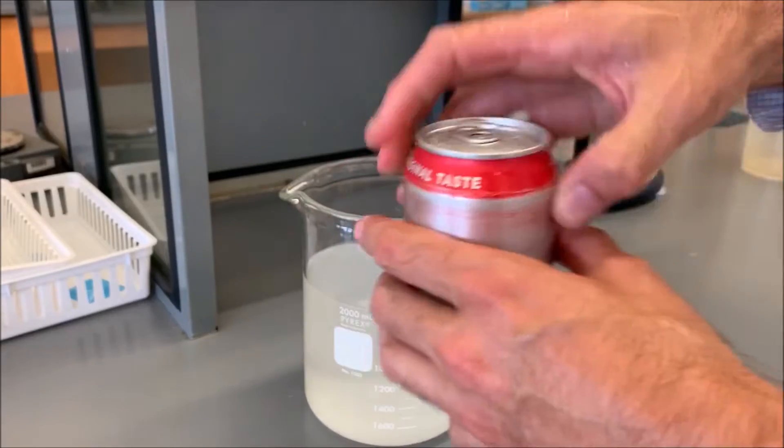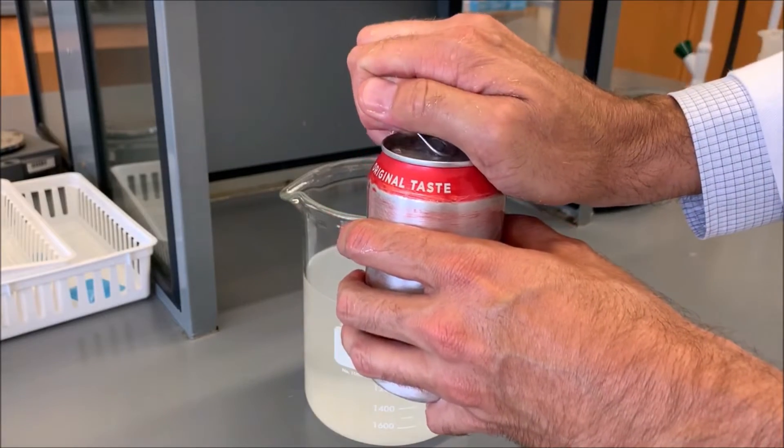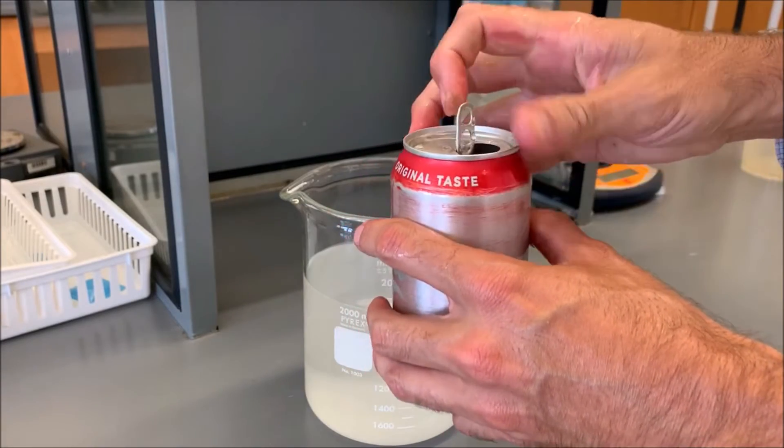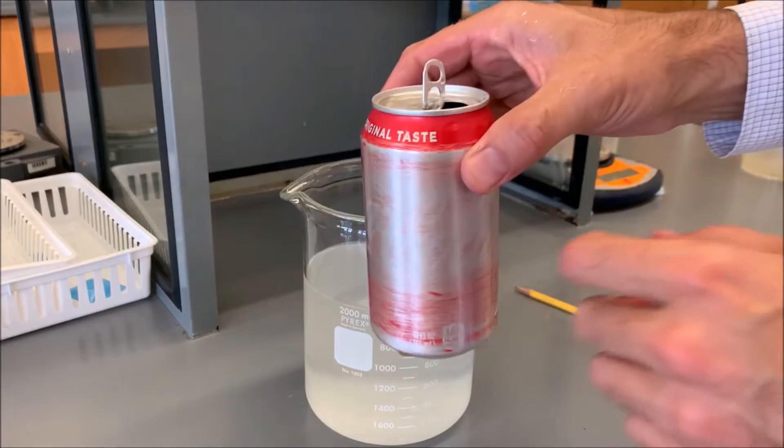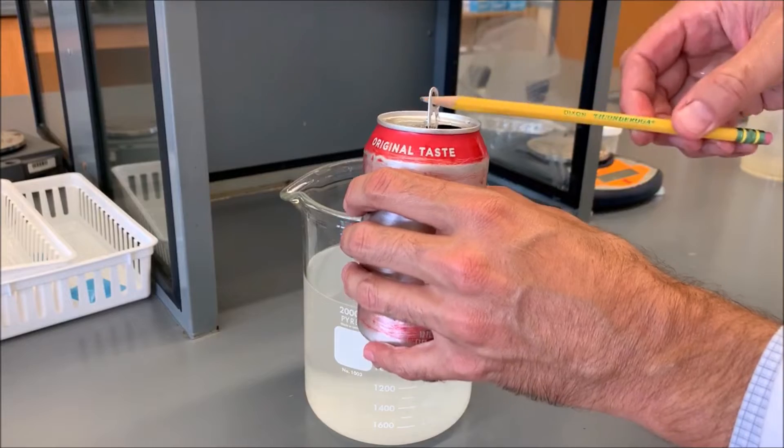To go into the aluminum bath to do the experiment, we're just going to open it up because we don't want the pressure to cause that lining to burst, because it's only a few microns thick. We'll suspend it into the bath using a pencil.